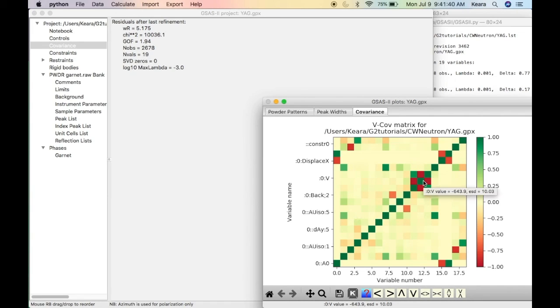Intense red or green indicates high covariance, green for plus and red for minus, and yellow is for close to zero covariance. High covariances naturally occur for profile coefficients and for background parameters. If during the course of one of your refinements you see white bands in this display, that is the signature of some singularities in your refinement. The offending parameter or parameters should not be refined independently. Perhaps a constraint or equivalence is needed.